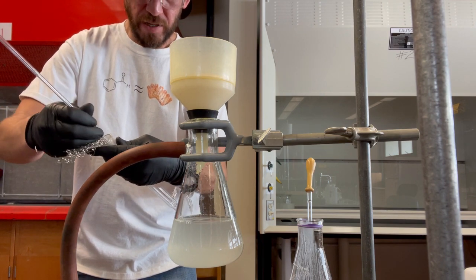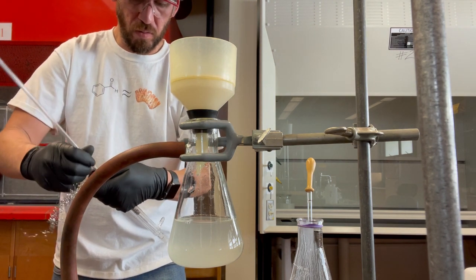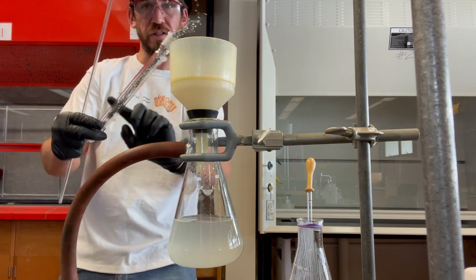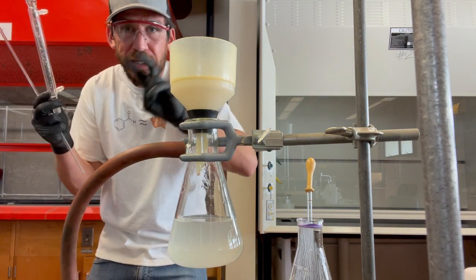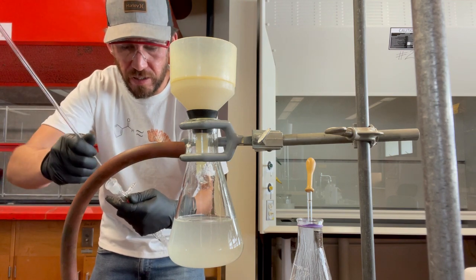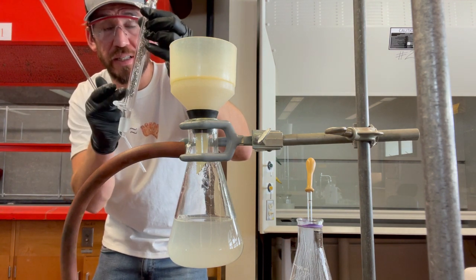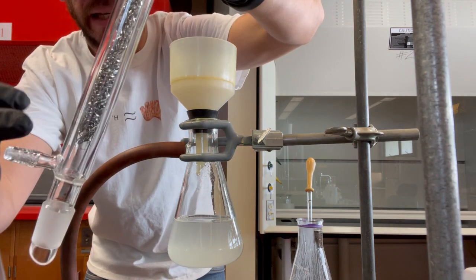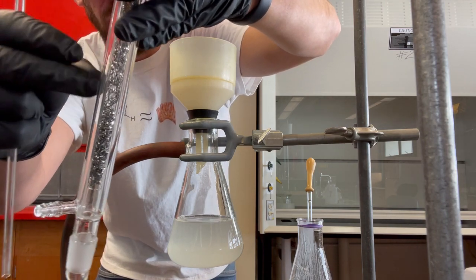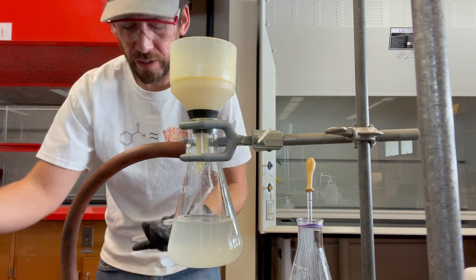So I didn't get to explain the packing of this apparatus, the column. For fractional distillation, as you know from the lecture, you want some stuff inside of here to increase the number of distillations, like theoretical plates. As the liquid goes through here, it's going to go to the vapor phase. It's going to condense on this stainless steel sponge that I'm using, and then after it condenses to a liquid, it's going to heat back up, go to a gas, and do it over and over until it gets to the top, at which point it can move on to the collection flask.